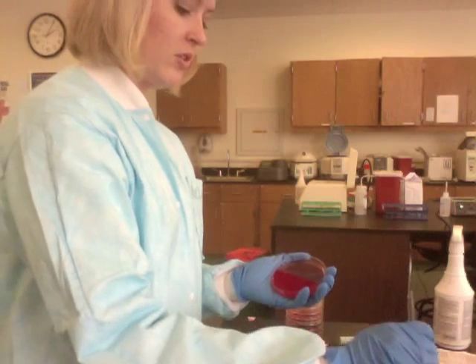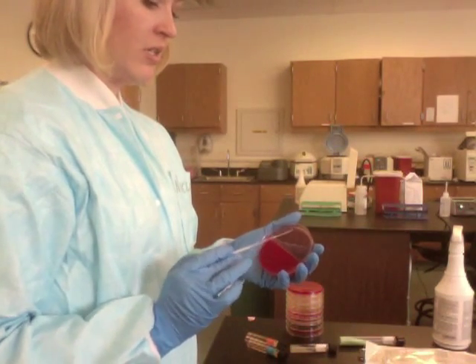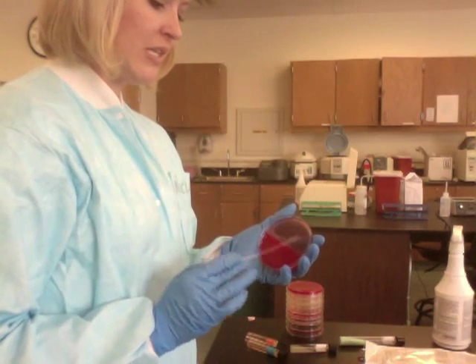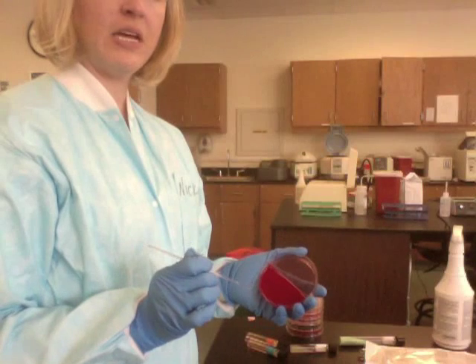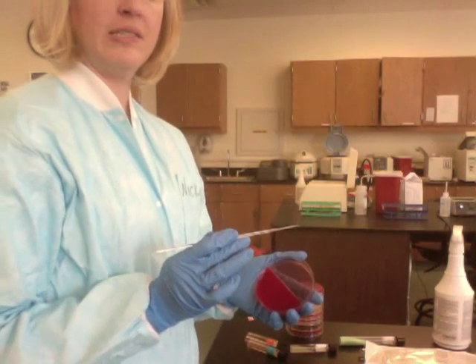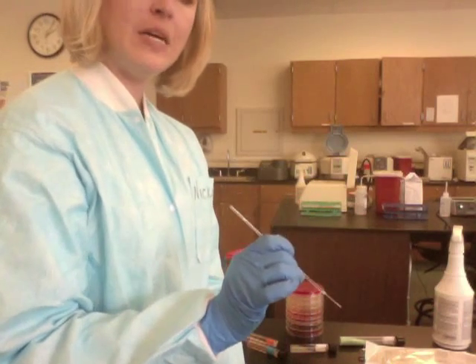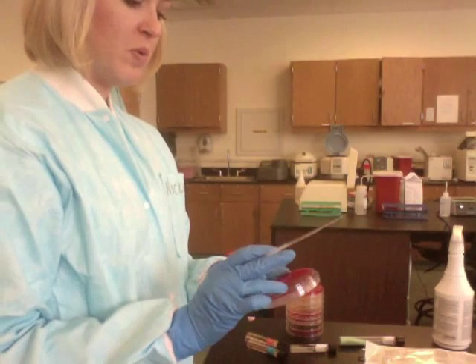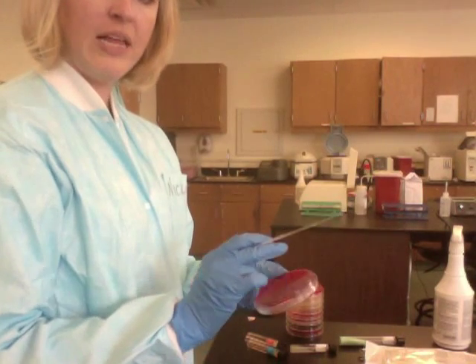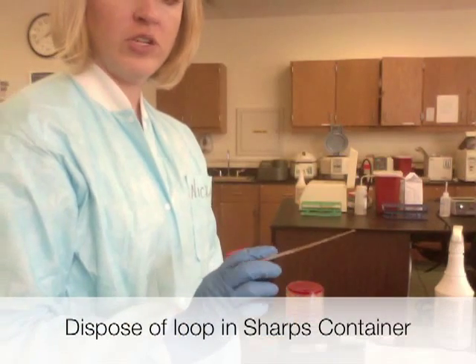Then you're going to turn, put the loop back in, bring it back out, and inoculate the MacConkey side. It is very important that you do two things: first, inoculate the blood side first and the MacConkey side second, and also that you re-dip in between each side. I streaked both sides the same — down and then across. That is how you do a urine streak isolation.